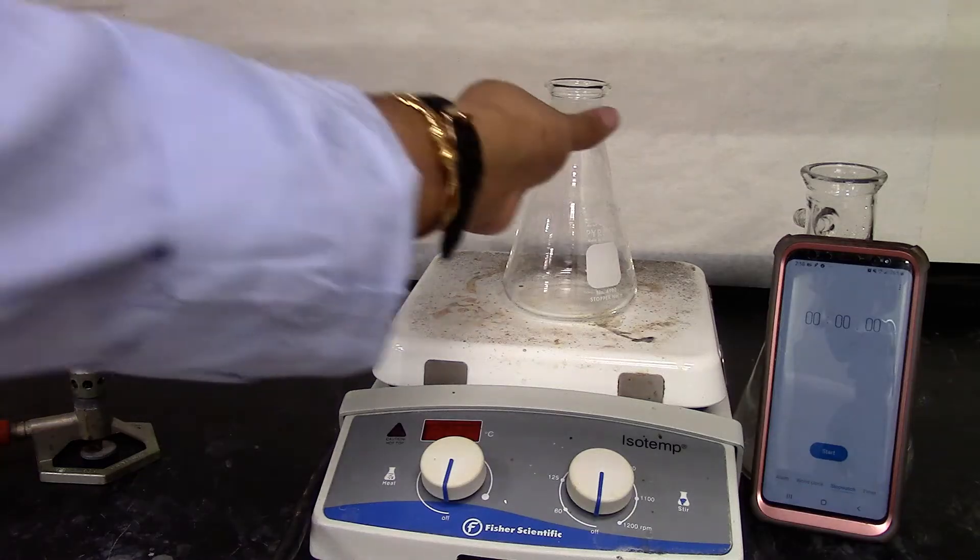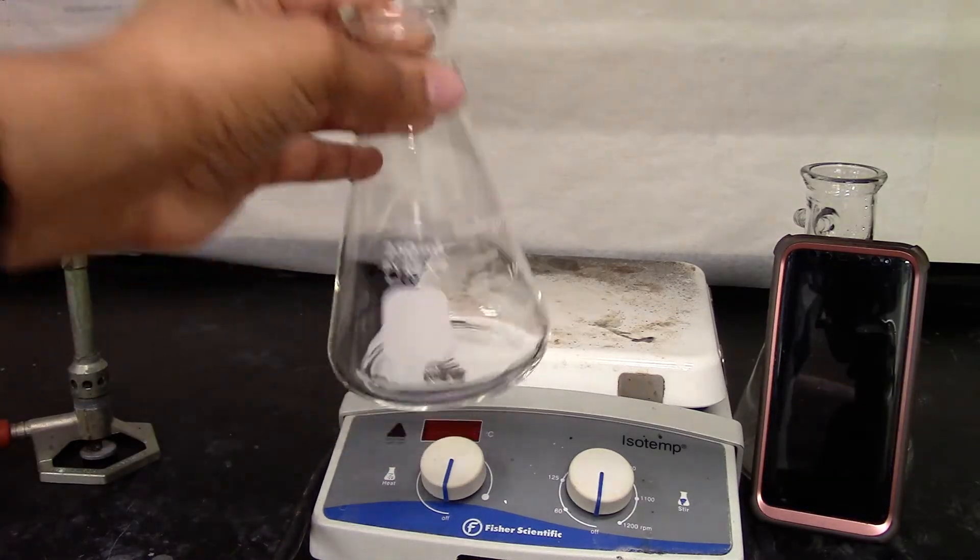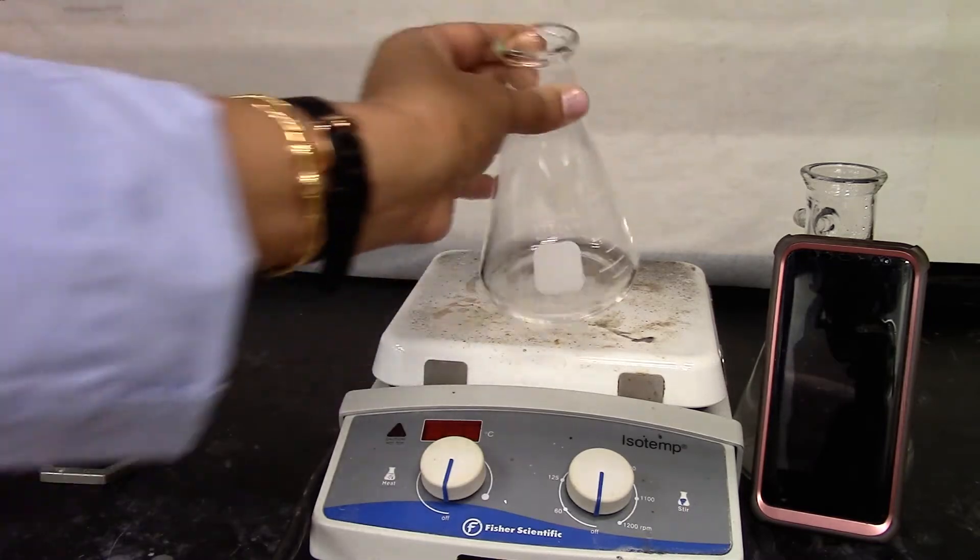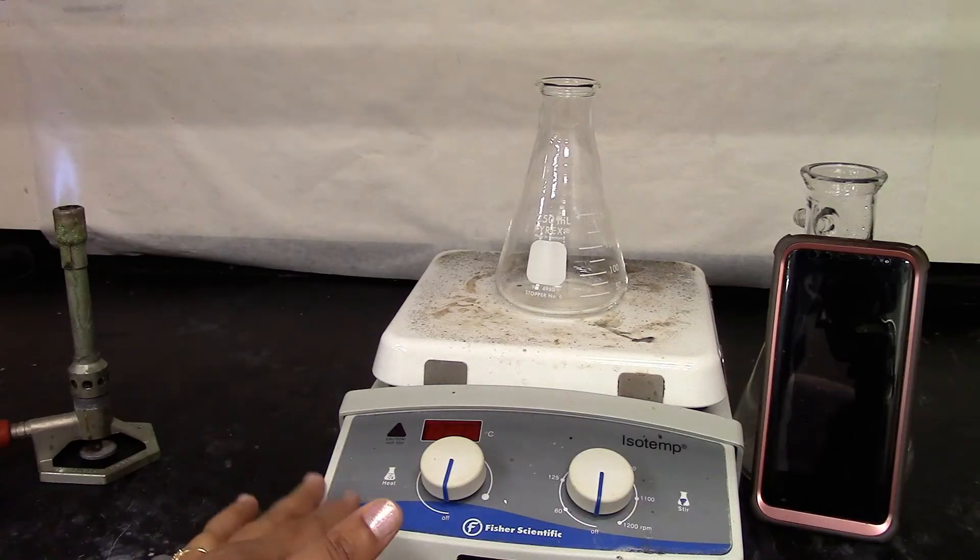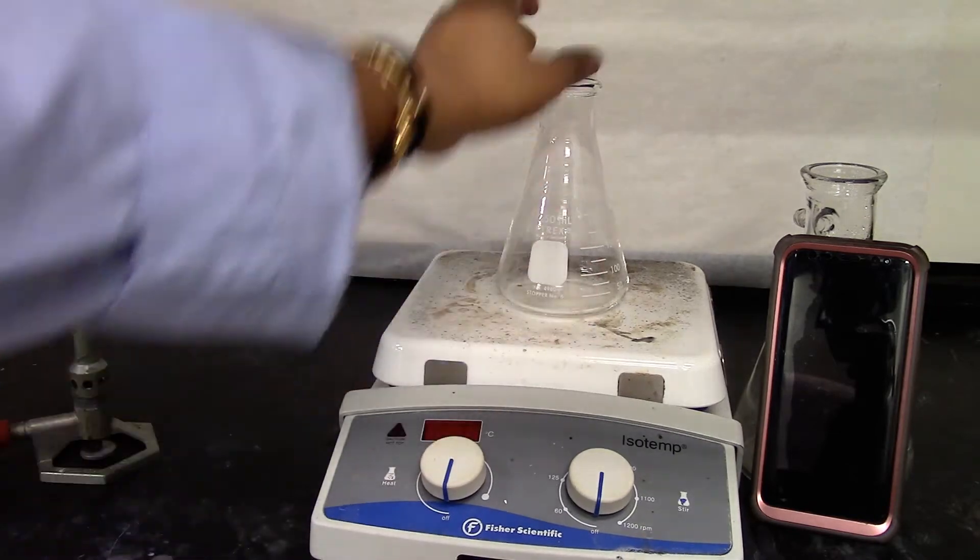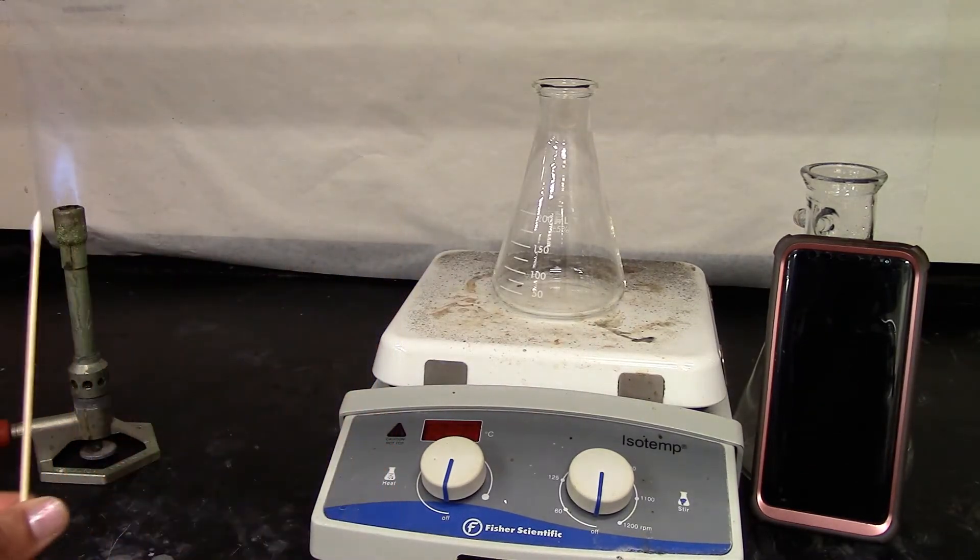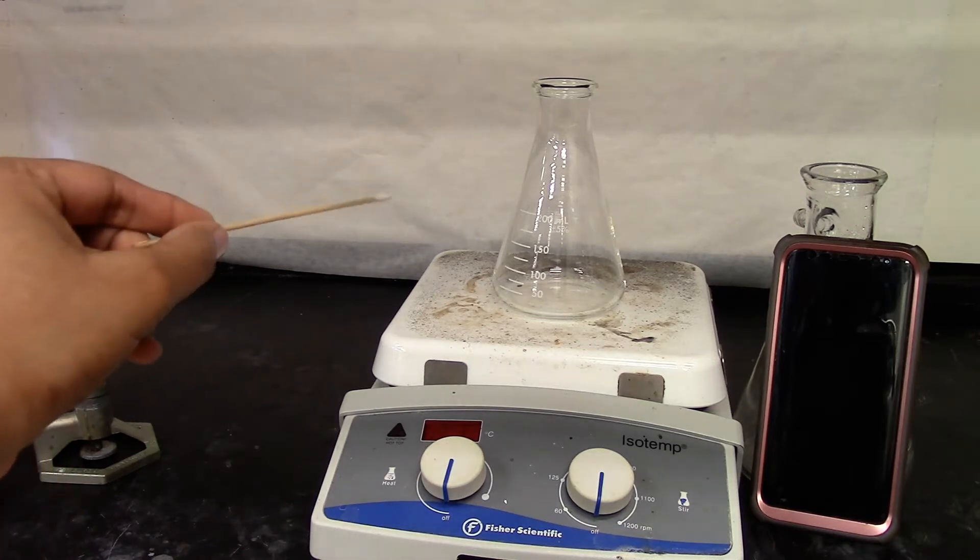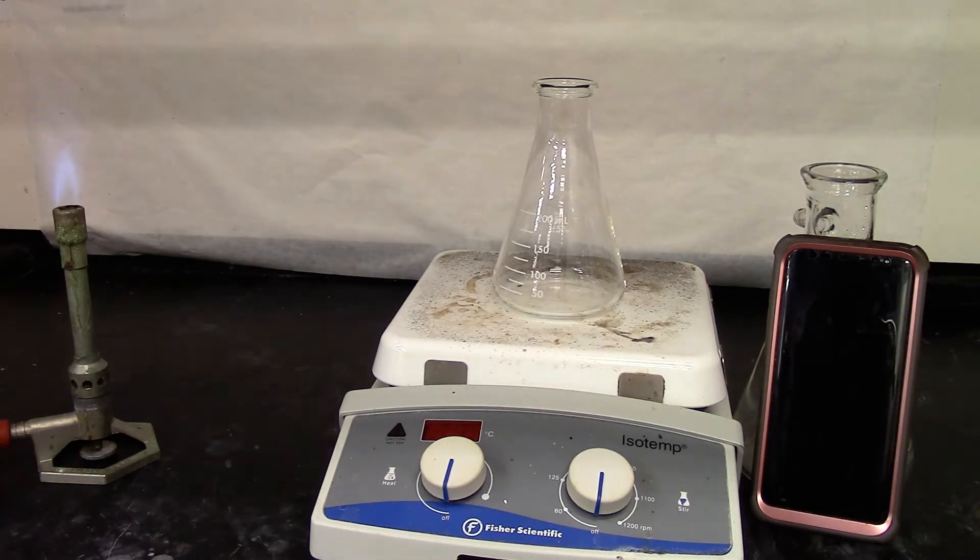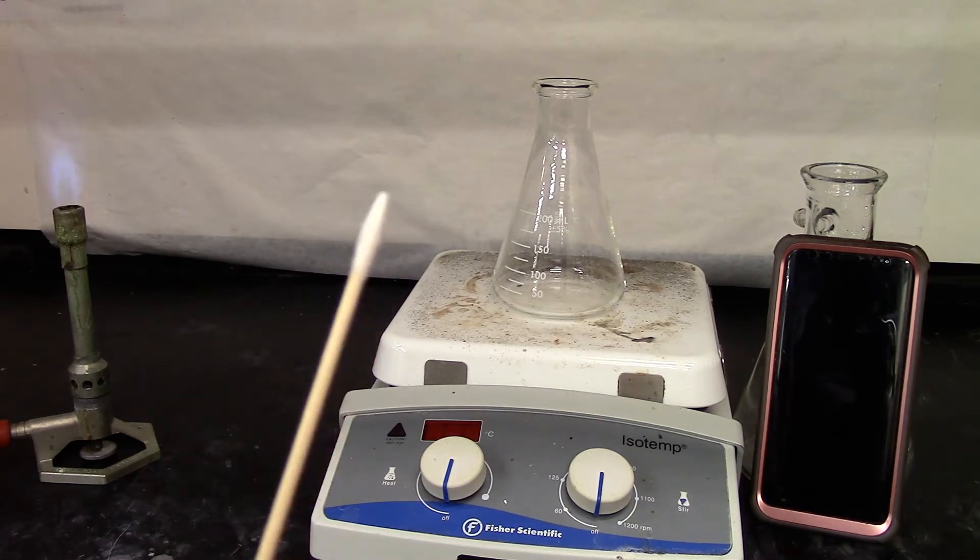So here is a 250 milliliter Erlenmeyer flask. It's clean and dry. The hot plate is not on. At the top it has room temperature. So I placed it on top and I have a splint. I'm going to burn it in the burner and place it inside the Erlenmeyer flask. We're going to see how long it takes for the splint to burn off.